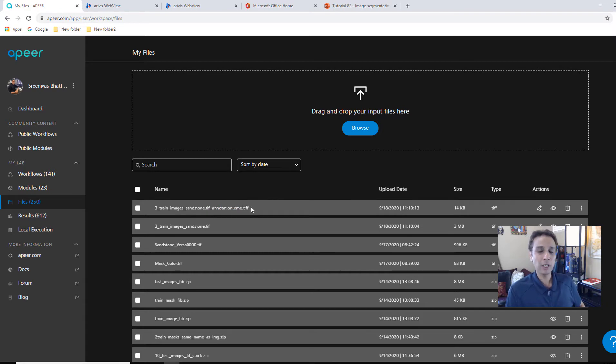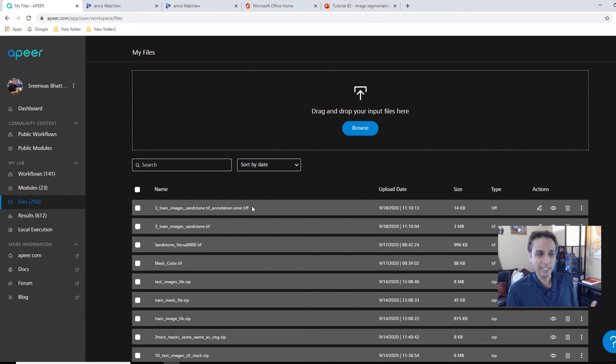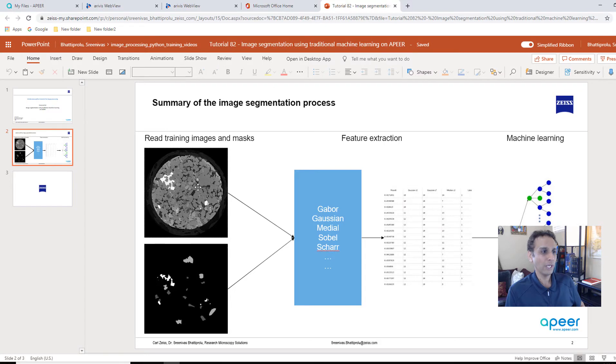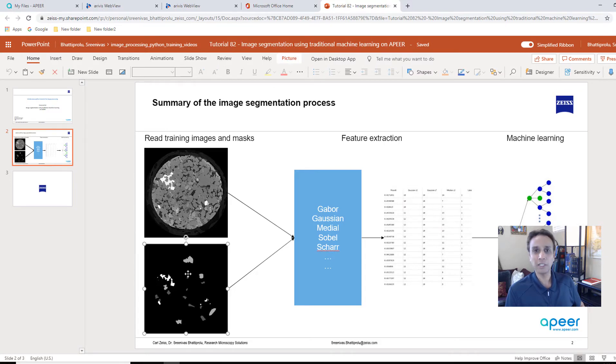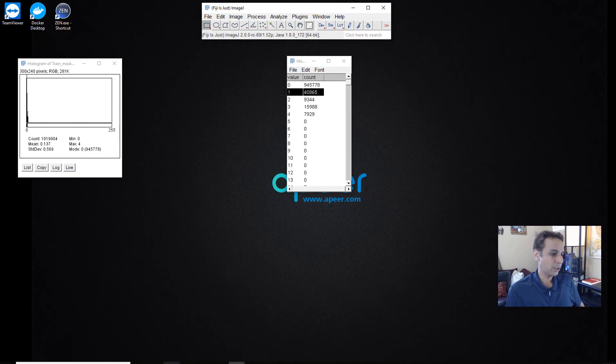So what do I have now? I have three images. Let's exit out of this. I have three images, one, two, and three and corresponding masks. So I have both of them available as part of my APEER. And by the way, for now, there is no way for you to get these masks. Once you label them, you have to download and then re-upload. We are working on making it directly saving it to APEER, but as of at least September 2020, download and then upload. Now we are all set.